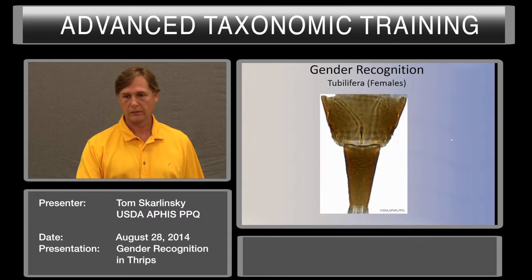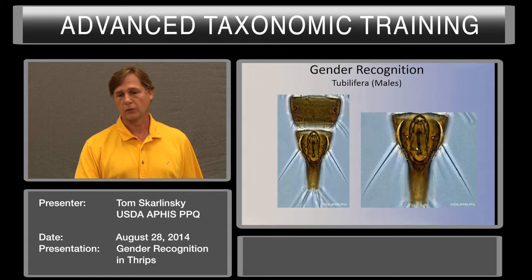In the Tubulifera males, you have the ediagus again for the boys — it's here. You also notice on the sides there are areas that separate this sclerotized region, so the whole area will open up.